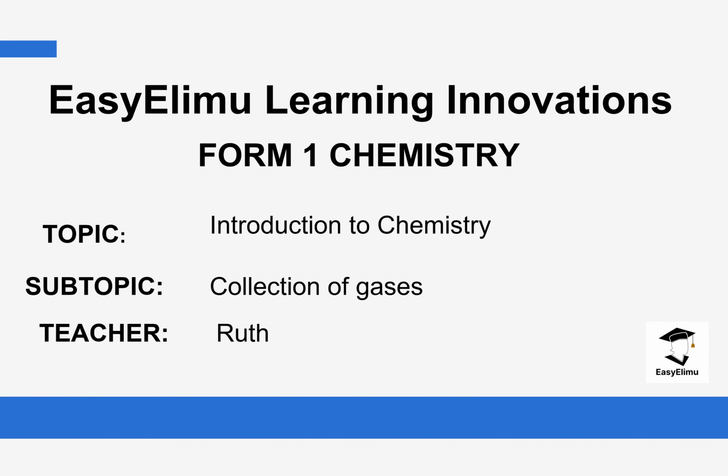My name is Ruth, and today we are going to be discussing the introduction to chemistry. We are going to learn about collection of gases. Previously, we were focusing on the Bunsen burner, and we looked at the different flames produced by the Bunsen burner, and also the best Bunsen burner flame that can be used for heating in the laboratory.